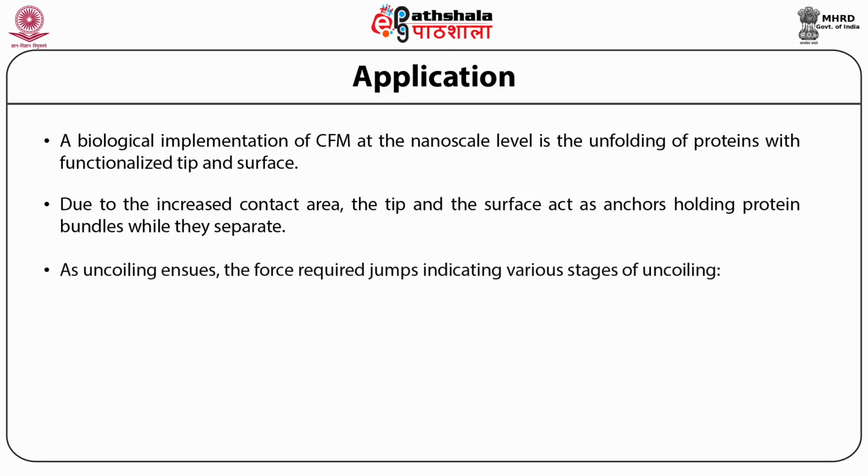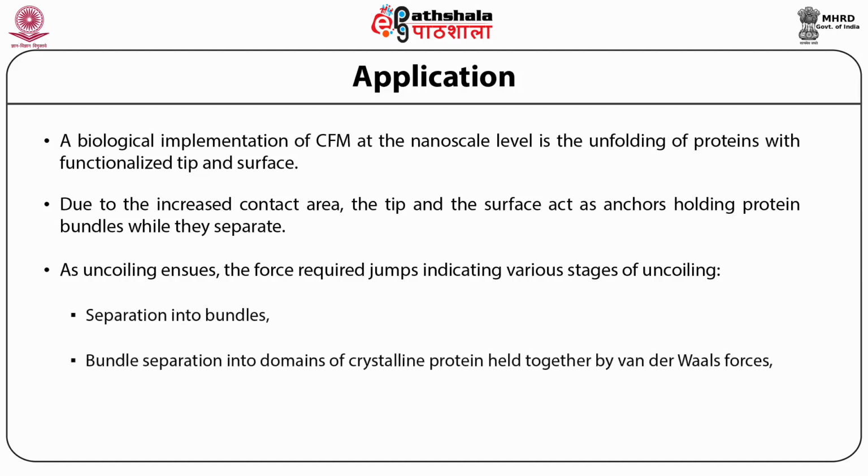The force required jumps, indicating various stages of uncoiling. The stages are: number one, separation into bundles; number two, bundle separation into domains of crystalline protein held together by van der Waals forces; and number three, linearization of the protein upon overcoming the secondary bonding.